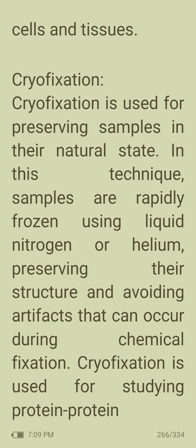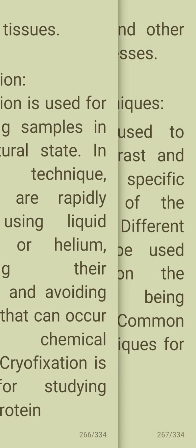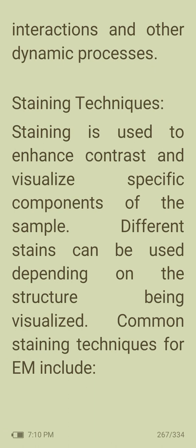Next is cryofixation. Cryofixation is used for preserving samples in their natural state. In this technique, samples are rapidly frozen using liquid nitrogen or helium, preserving their structure and avoiding artifacts that can occur during chemical fixation. Cryofixation is used for studying protein-protein interactions and other dynamic processes.